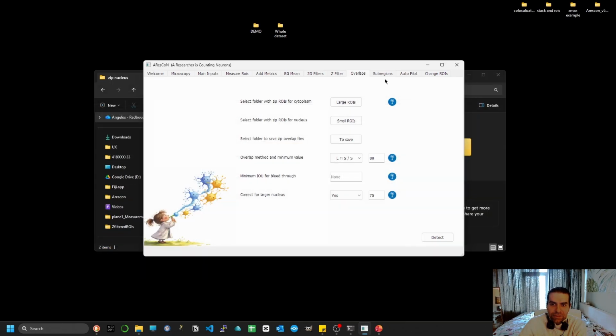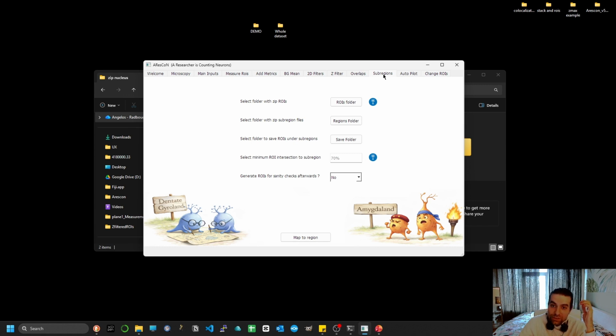And having run the overlaps, the other thing that you can do is imagine that you have drawn some regions already manually. You can either do it manually, or there are some really nice pipelines out there, which unfortunately I haven't experimented much on, like Quint, for instance. Quint actually does the whole thing, not just the atlas registration, but also cell detection.